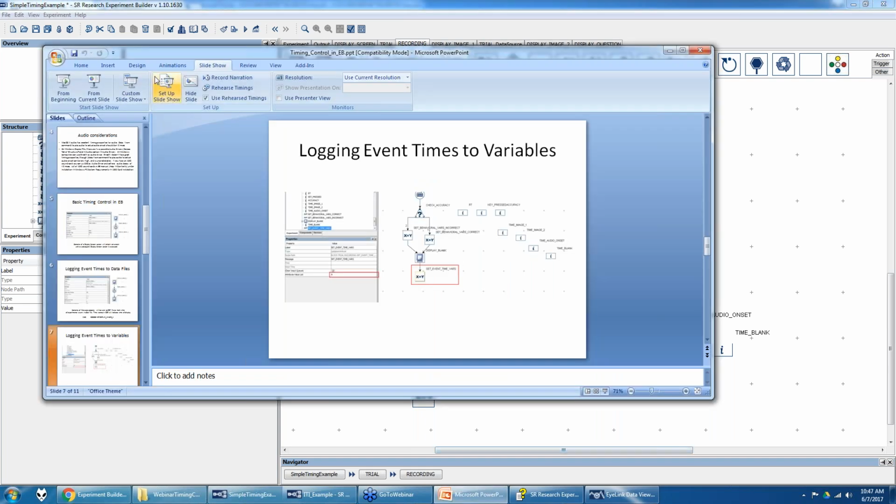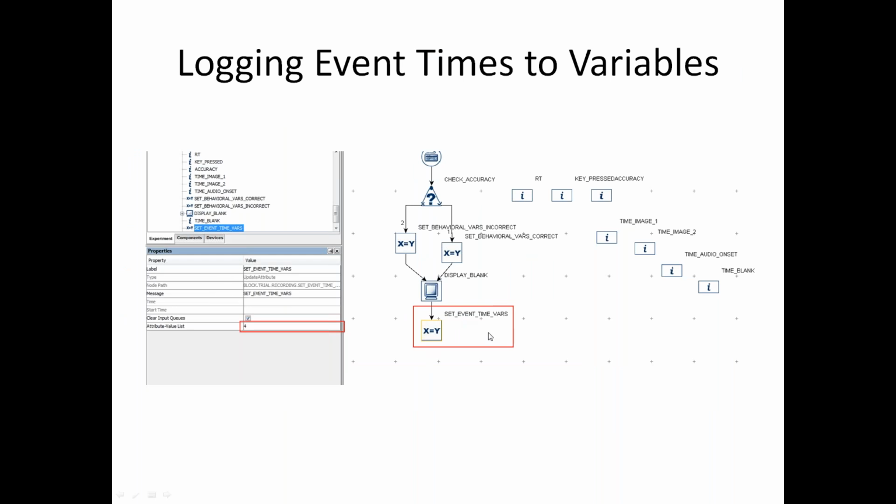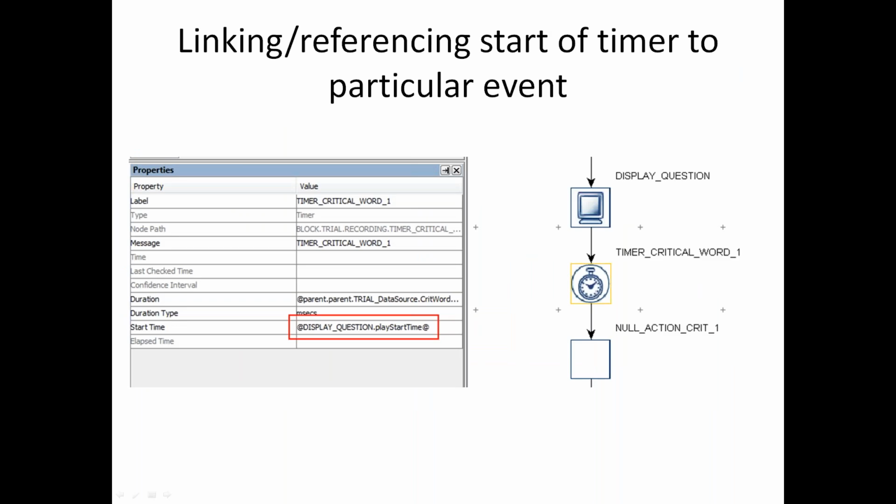That's what I was trying to illustrate here, and this little node is the one that does it. Then, another trick. So let's go back.